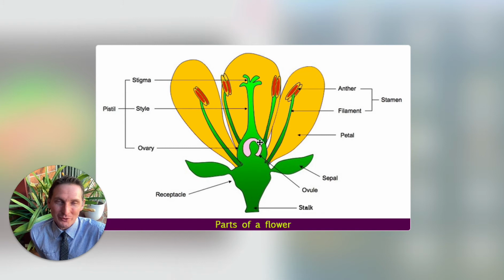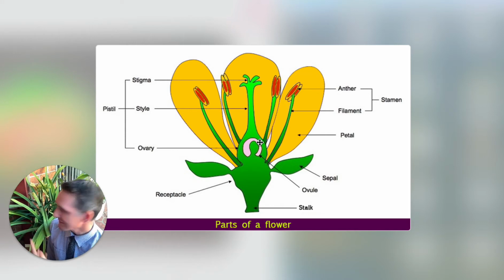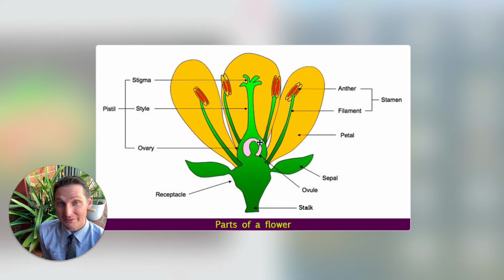How does it do that? Well, you probably already know birds and bees transfer pollen. That's fine, but let's go a little bit deeper in the science. Today you're going to dissect a flower to work out the parts of the plant and why each part is necessary for the reproductive process, for sexual reproduction in angiosperms. I'm sitting in front of a clivia, and these clivias at the moment have lots of flowers on them, and I want you to do a dissection of flowers yourself.